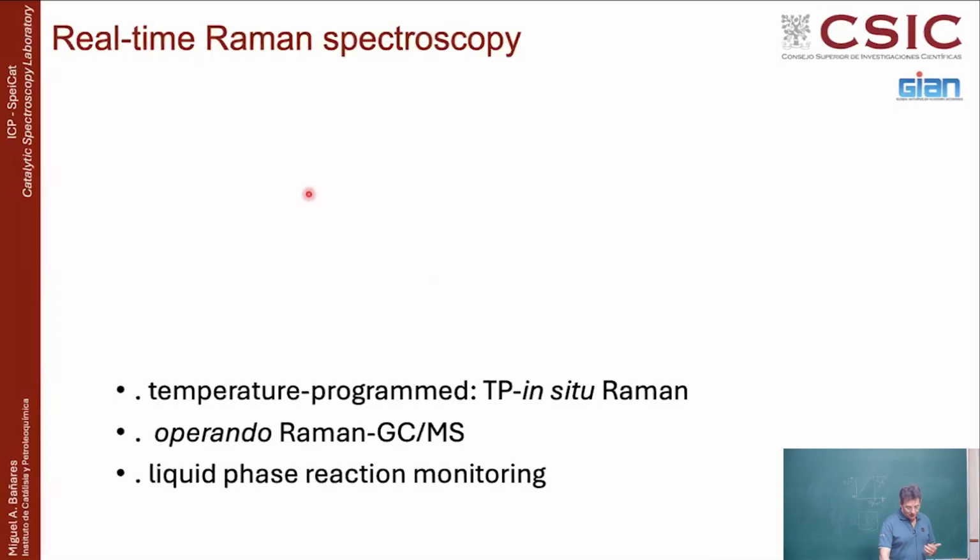Real-time spectroscopy, you see that I'm dragging the jumping into operando, but there are many things. Raman per se, characterization per se is important, in situ is important, operando is important. I want to go little by little, because if I begin with operando, that was the end of the course. So operando will be coming in due time.